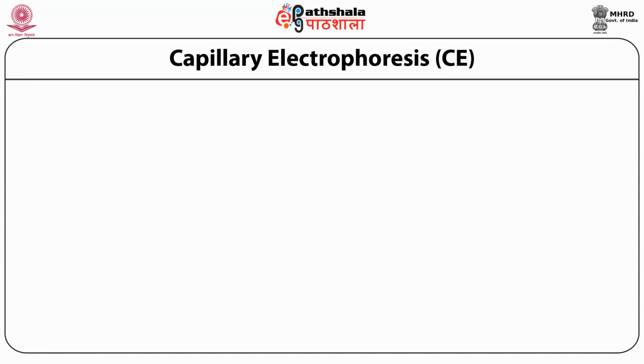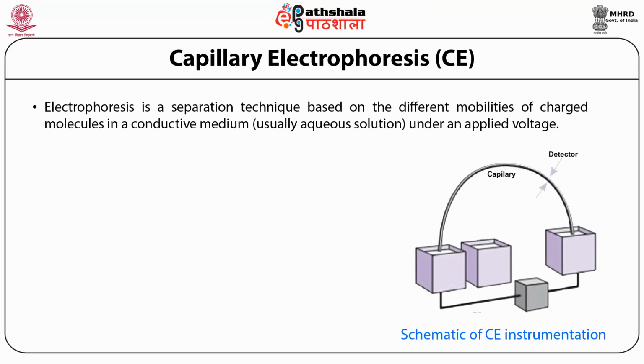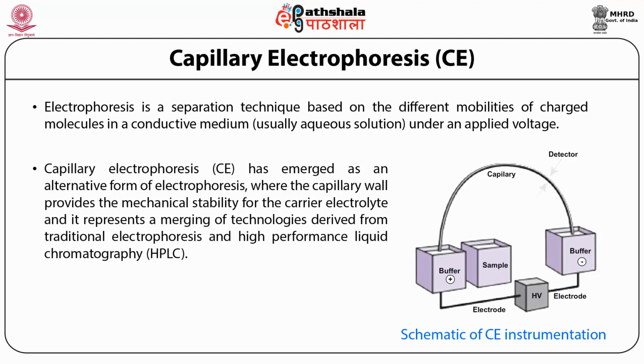The capillary electrophoresis. Electrophoresis is a separation technique based on different mobilities of charged molecules in a conductive medium, usually aqueous solution, under an applied voltage. Capillary electrophoresis, known as CE, is a modern high-performance separation method. The separation is based on different migration of analytes in a capillary over which a high voltage, typically 10 to 30 kilovolts, is applied. Typical inner diameters of commonly used capillaries are in the range of 25 to 75 micrometers, and the detection is usually on column.